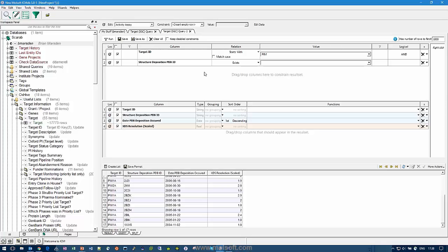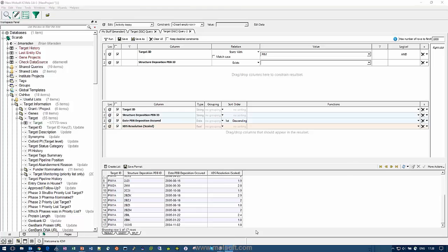I'm going to pause now because I've shown an awful lot in a very short period of time, and I'm sure there are lots of questions. Andy, are there any specific ones that we can answer right now? Hi, Andy. Sorry, I need to open my mic. So yeah, one was related to what you just mentioned about saving queries.